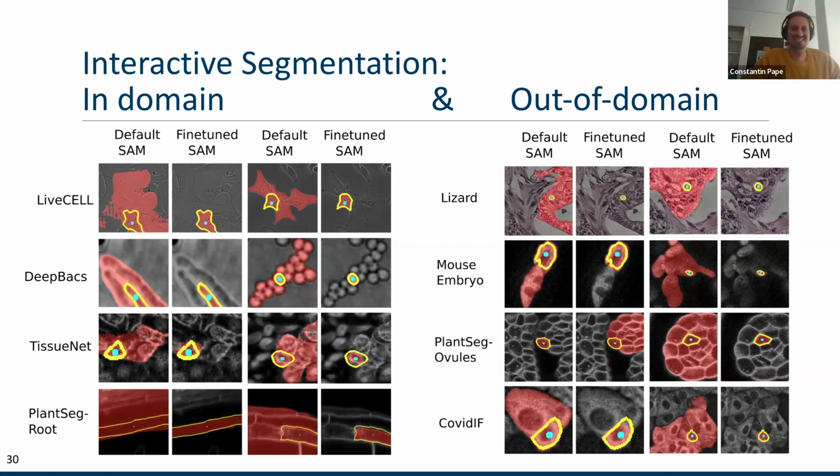Thanks. I was curious. In our experience when we were trying this, it seems to prefer blobs and doesn't really like long and thin things like microtubules, say. The cells in the live cell data that you showed during the demo have some long stringy things and are not super convex. I was curious which datasets were the least blob-like and how much fine-tuning helped on things like that.